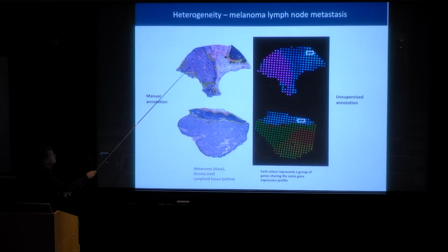But if you look at this tumor, you have one gene transcription profile here indicated in violet, while this tumor has multiple gene expression profiles. You would not have seen this by bulk analysis, definitely, and you would probably not understand this complexity by single-cell RNA sequencing. So this is a beautiful example where spatial components add information. And obviously, if you think about digital pathology, you would never find this kind of pattern if you haven't looked into the gene expression profile. The histology in itself is not sufficient.